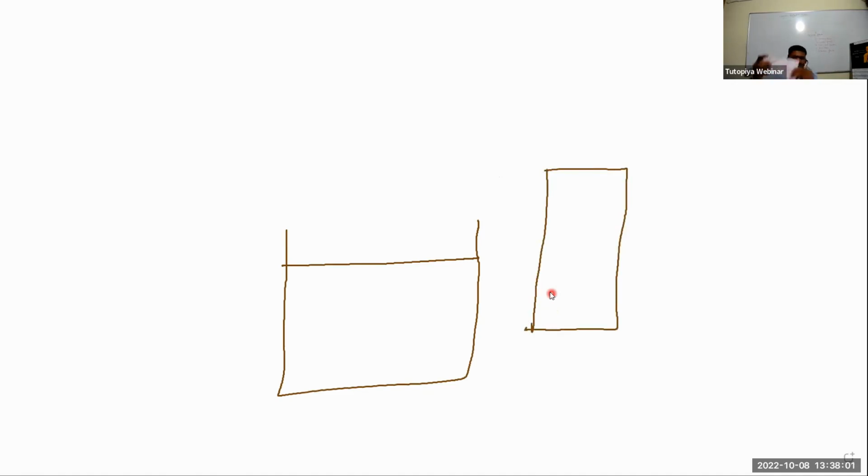I could have made this before itself. Take a paper like this, okay, from 2 centimeters above the bottom, draw a line like this with a marker, and stick this paper to a pen or a pencil and keep it in that glass. But take care that this marker line should be above the water level. Do not take too much water. I'll take only a little water, up to here. Yeah, this is the water.